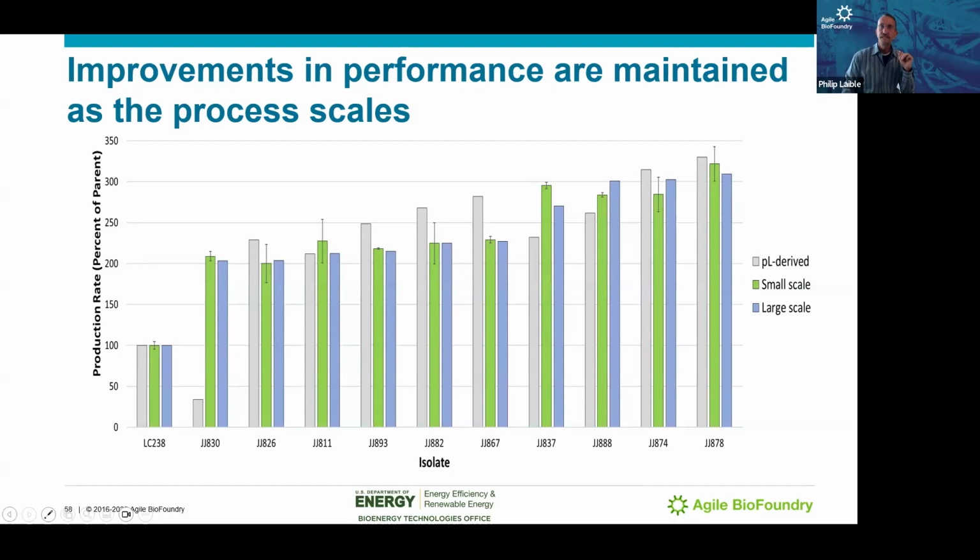So it's easiest to see a comparison of how they were evolved in these small little droplets shown in gray compared to evaluations in multi-well plates shown in green, and then at the 1-liter shake flask level. And we've done some of these now in bioreactors over the summer. You can see how the performance enhancements are preserved. And so what we're seeing at small scale is relevant at larger scales. And so we're really excited about this technology and the use of it in the future.